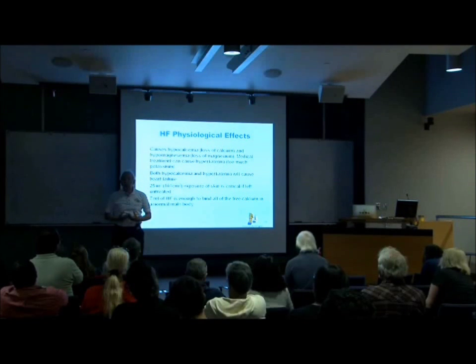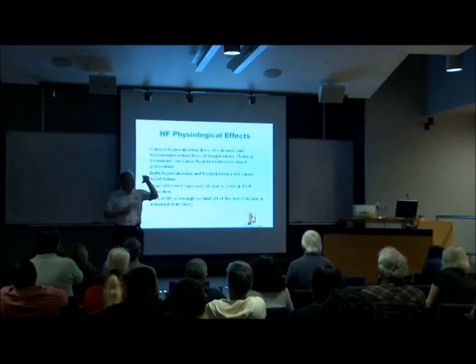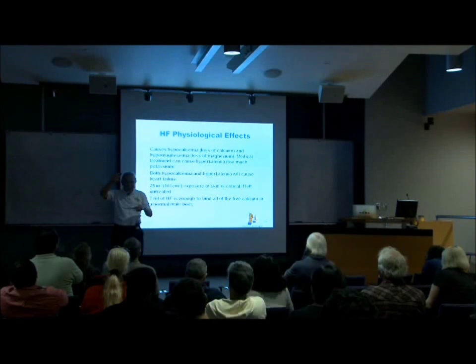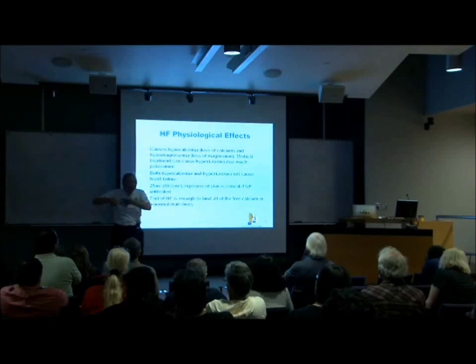I had a guy, a chemist, that splashed himself with phosphorus oxychloride. The jar broke, saturated his lab coat. He hit that safety shower, and what happened? You've always been taught to pour water into acid or acid into water. What's the basic rule? Acid into water. What are you doing? You pull that safety shower, you got water into acid, and that hydrolysis reaction gave him second-degree burns across his entire chest.